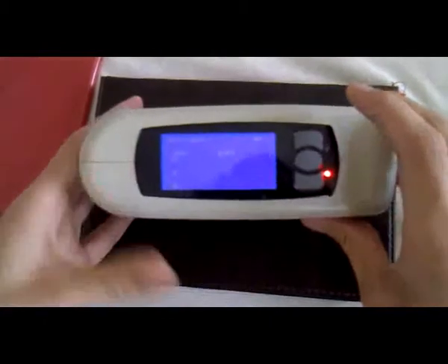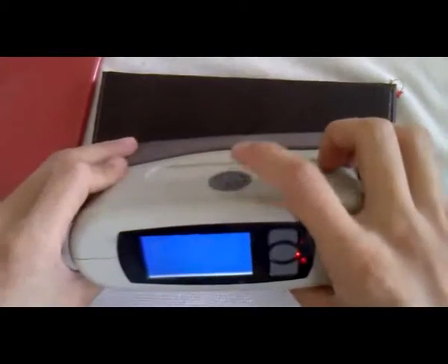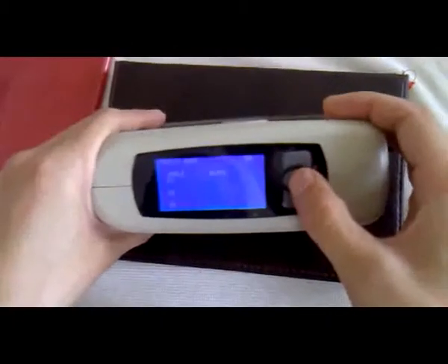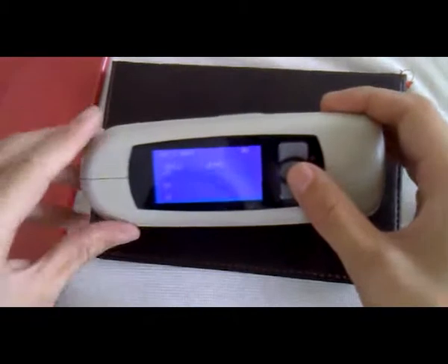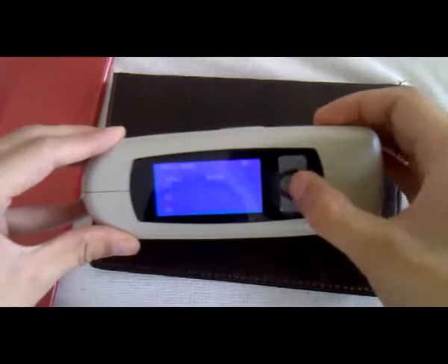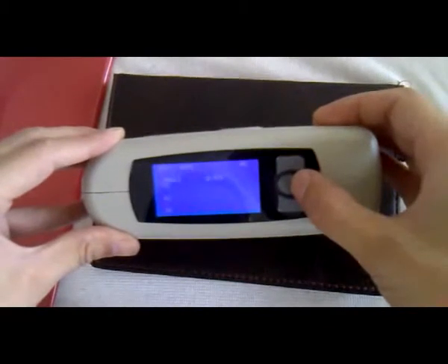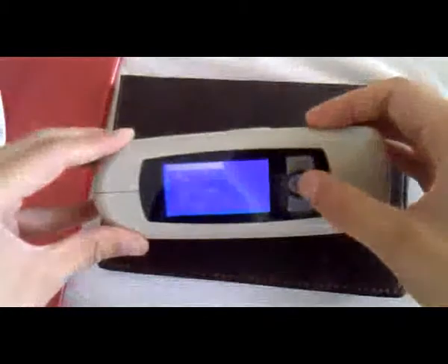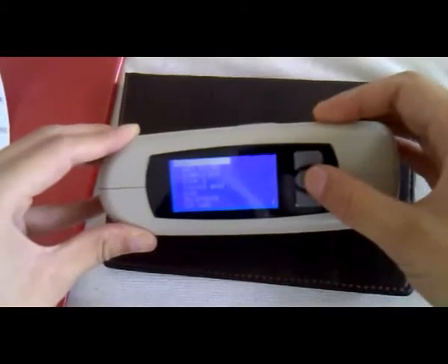Now, press the test key on the side face. Now it's the main interface. This is 3. The middle of it is the menu key. This is up and down. We press the menu — now it's an interface.